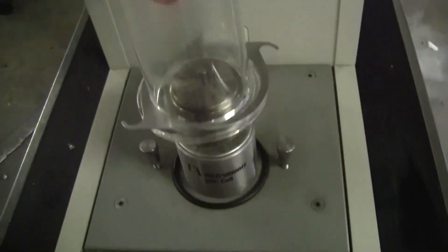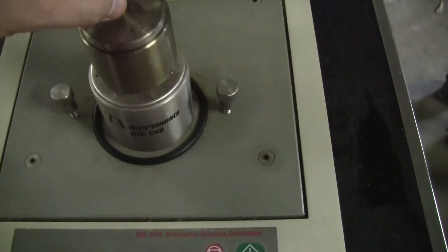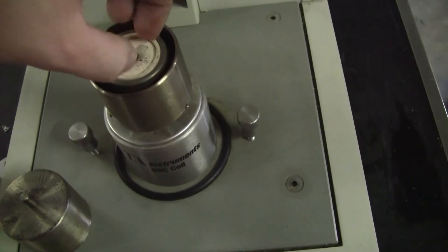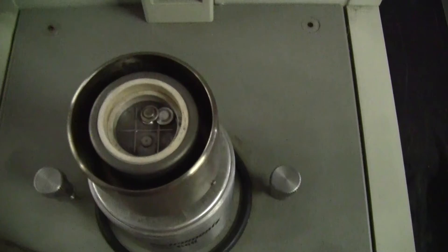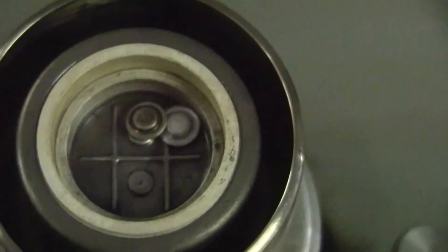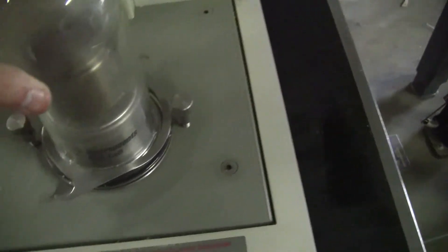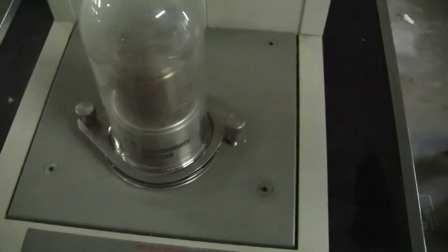Go ahead around the front and show you the inside of the chamber. Pretty clean. You still have two samples in there. Bottom of the lid. Seal's good. And your tie down.